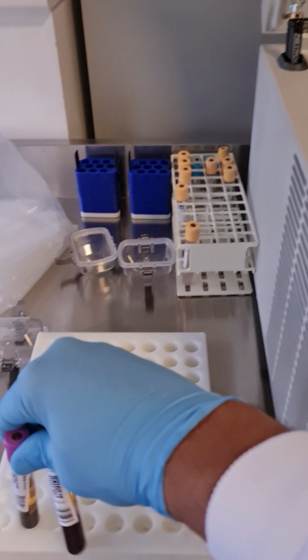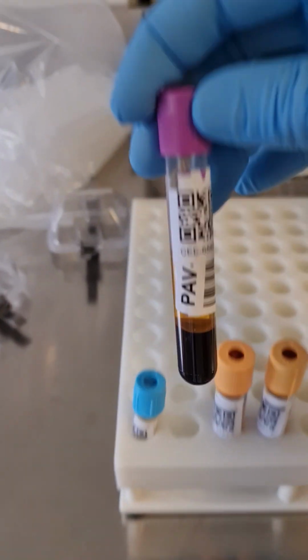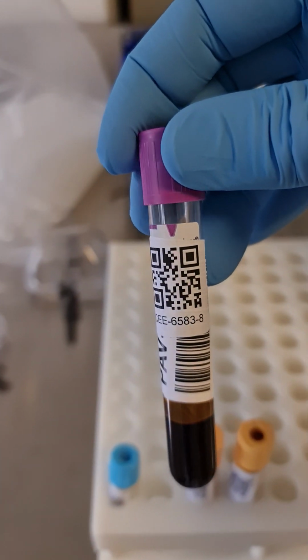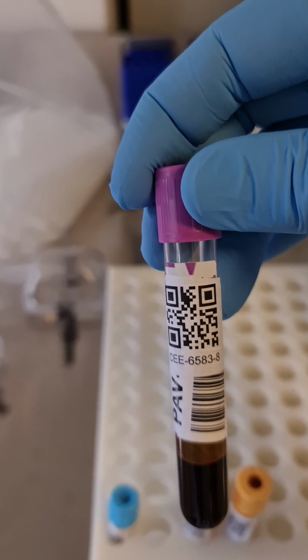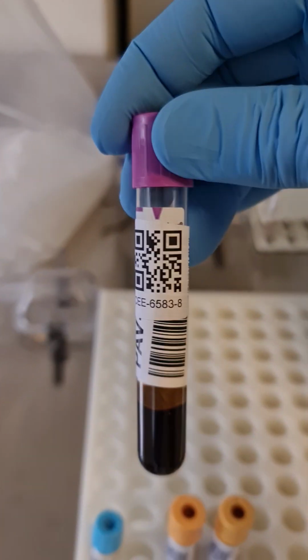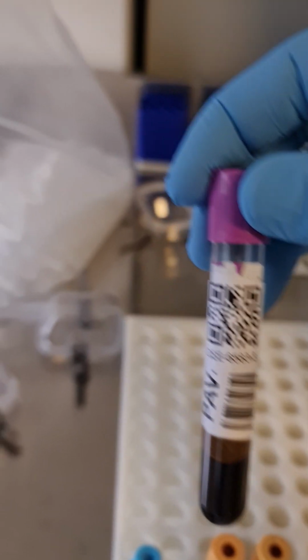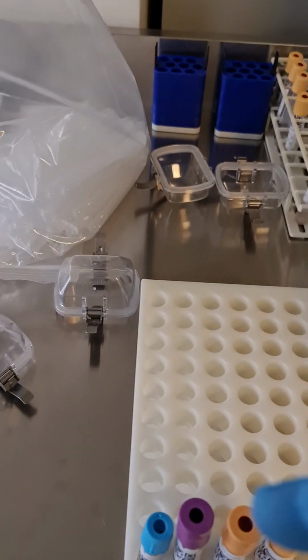So just remove the sample from the centrifuge. So we have CEE 6583. If we have more than one sample, the next number will follow, CEE 6584 and so on.